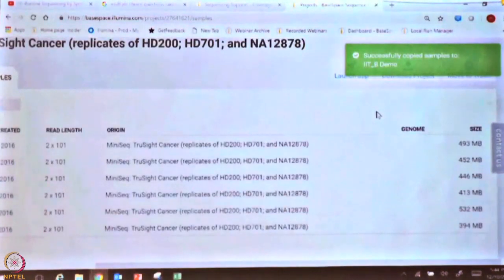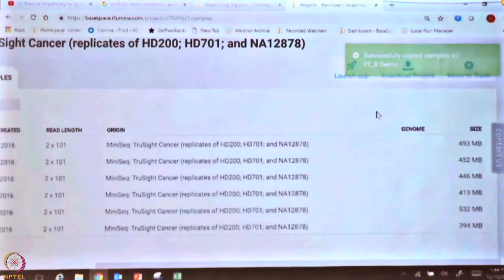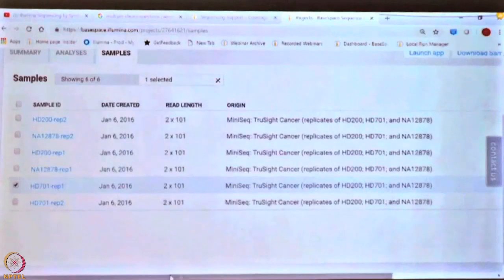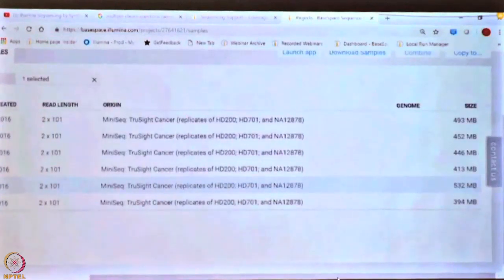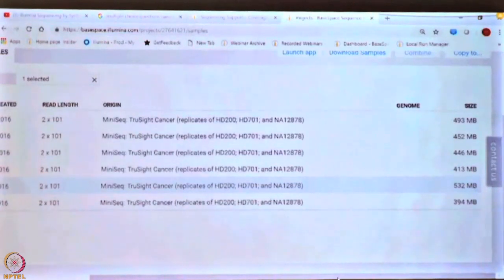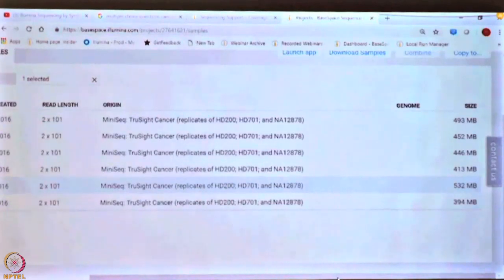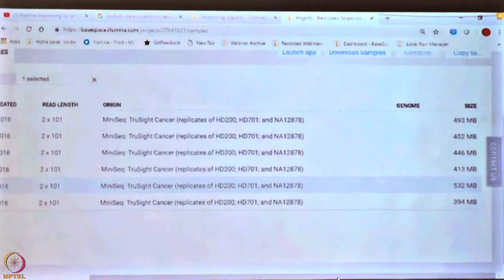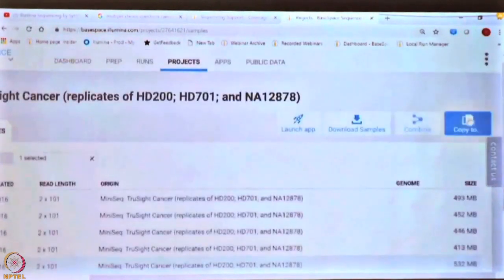The reason we are doing this is to show you how data sharing works on BaseSpace. The key thing we wanted to demonstrate is how you can share data across different users, because this is meant to be a collaborative platform. If there are any public datasets that you want to analyze, this is how you would import that data into your own workspace so that you can run your own analysis.